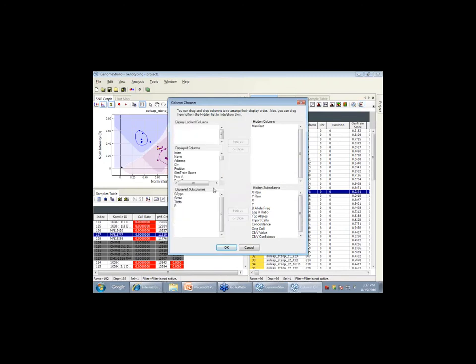Okay, so I'm running out of time. There are 2 things we need to do to get the tetraploid data, which is what you guys are here for. So make sure you're on the full table tab. We're going to choose columns, and we're going to keep the index, the name, the address, and delete everything else. So I've clicked on chromosome position, I'm going to slide down, hit the shift key, highlight everything, hide the rest.